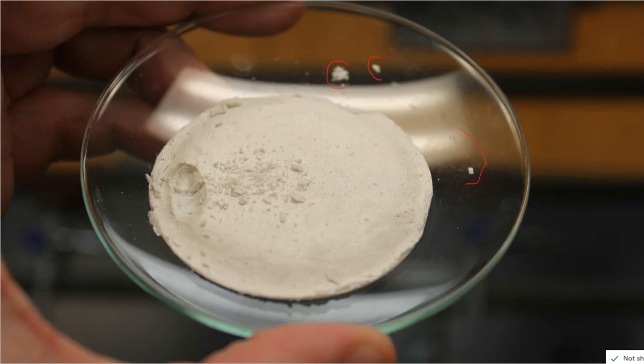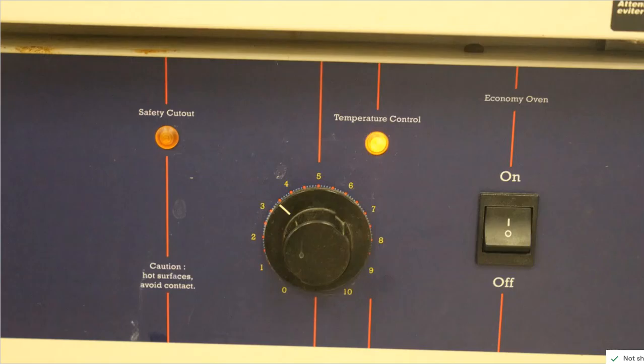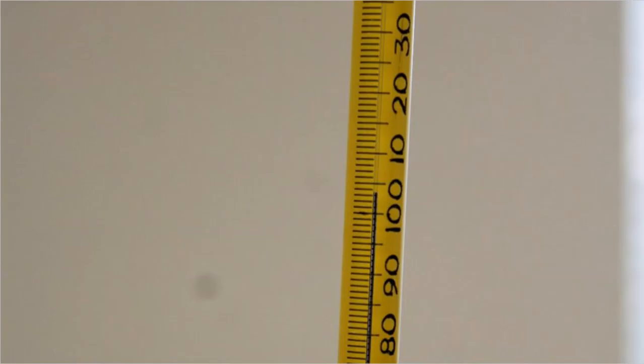But this needs to be dried. So I go to the oven that we have in our lab. I open the oven up. I record the settings on the oven. So that's the knob setting. And I record the temperature setting. And this is it. Good news is that this is above the boiling point of water. That's at 100. So I know it's going to drive water off.